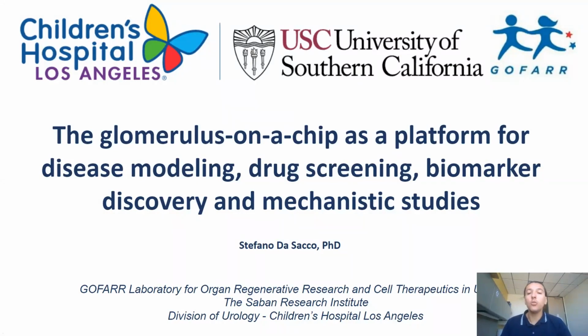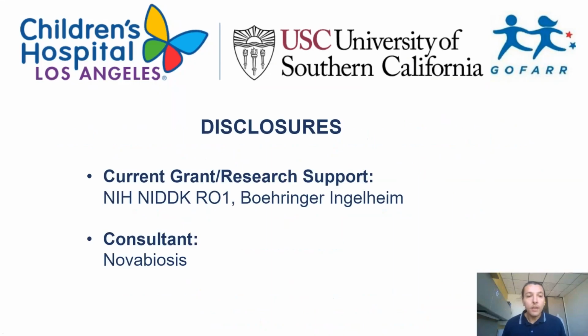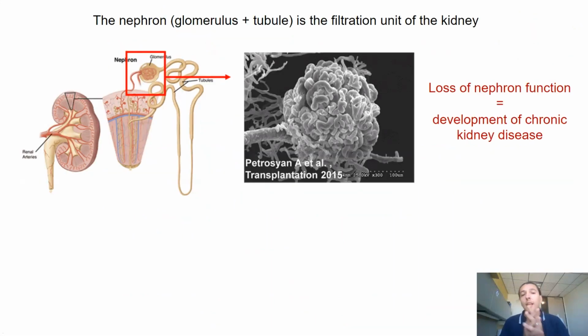Today I'm going to talk about the Glomerulus-On-A-Chip as a platform for disease modeling, drug screening, biomarker discovery, and mechanistic studies. These are my disclosures. And before starting, let me just tell you a little bit about the kidney.